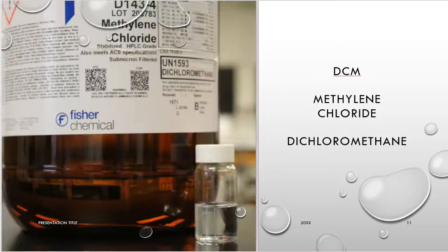And then finally, we need some methylene chloride, and the methylene chloride is going to come straight from a bottle here. The methylene chloride has a Fisher chemical manufacturer, and this particular lot number is UN1593, or sorry, that's the item code. The lot number is up here at the top. That's 203783. So again, it's 203783. So this is my methylene chloride.